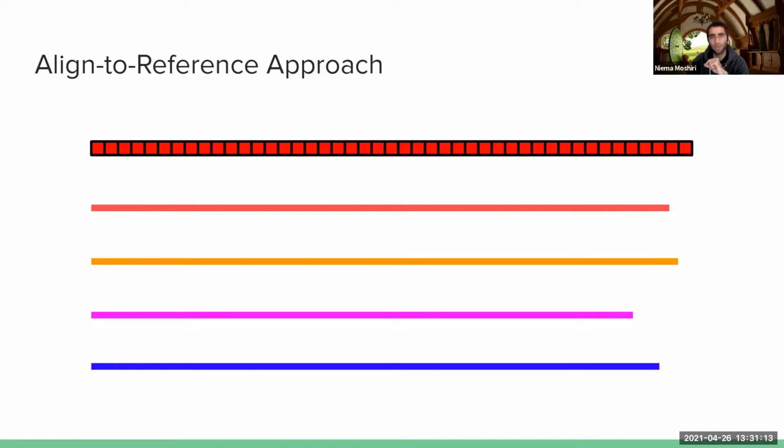And then what I can do is use the positions of my reference genome. Here, every one of these little squares is one of the letters of my reference genome. It's either an A, C, G, or T. But remember that in those pairwise alignments, every letter in my consensus sequences aligned with one of the letters of my reference genome. So what if I use my reference genome's letters as anchors to combine all of the consensus sequence letters that align to that letter? Let's look at the first letter first.